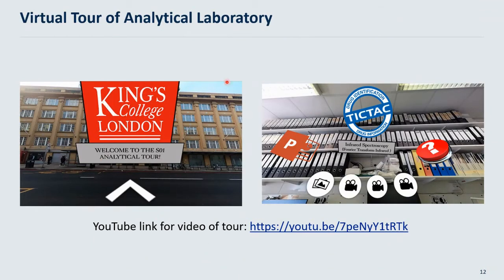So this slide, this picture here is the front of the building, and this guides them into the building. So you basically click on this hotspot there, which guides you in. And to the right is an example of the information that you're given. This is for the Fourier transform infrared spectroscopy, and this is above the actual instrument.